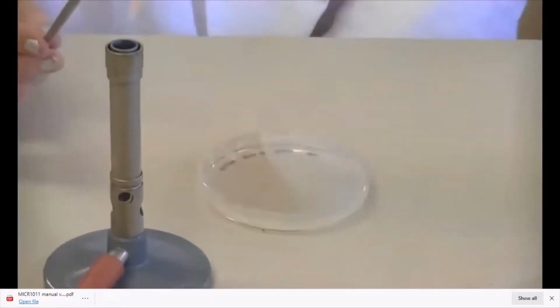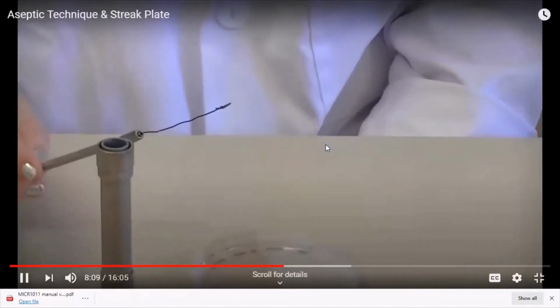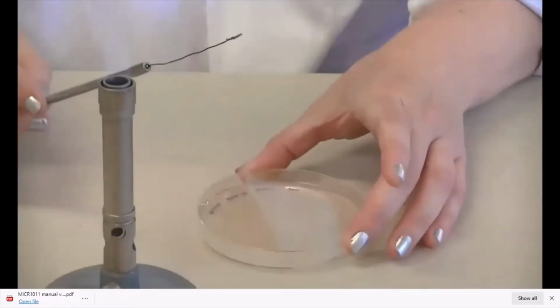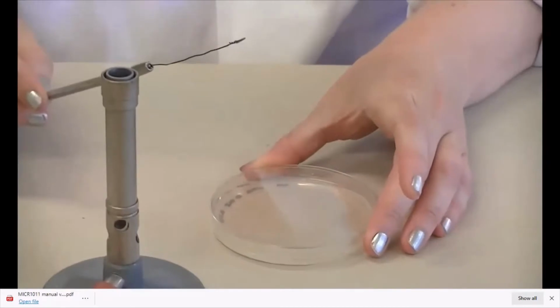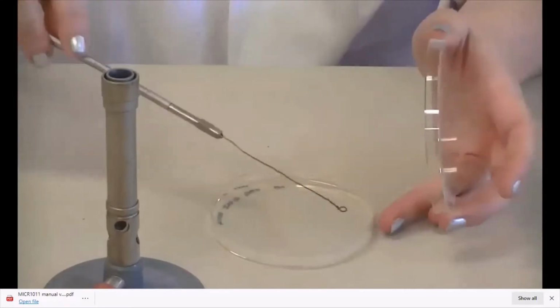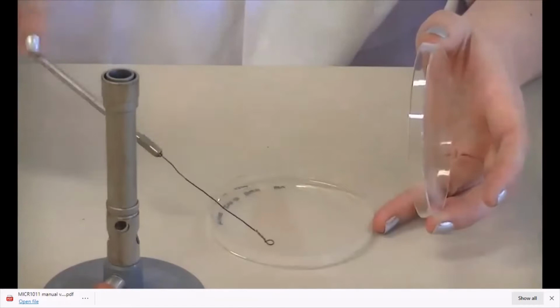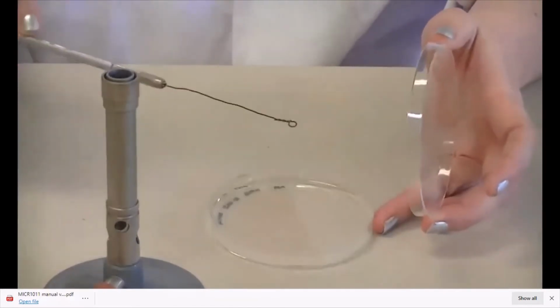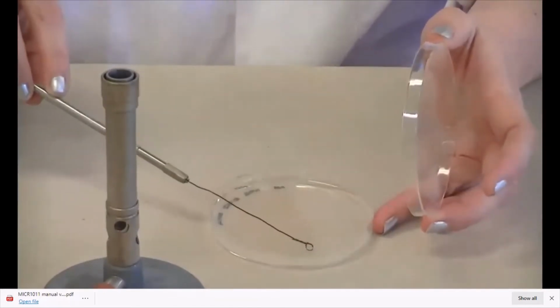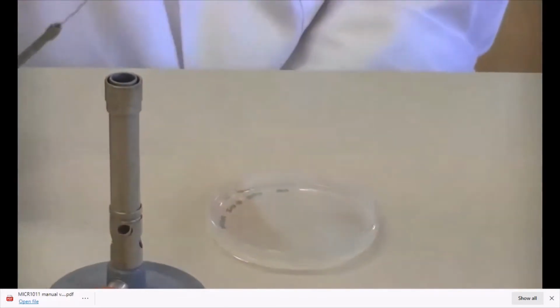Replace the lid and then flame the loop for the final set of streak lines. So I've turned the plate. I'm going to check that my loop is cool, and I'm going to intersect the tertiary lines with the quaternary lines. 1, 2, 3. And now I'm going to flip the loop upside down, drag a vertical line through those lines, and then a zigzag into the middle of the plate so that I get my single isolated colonies.